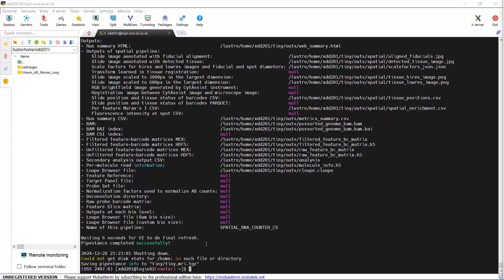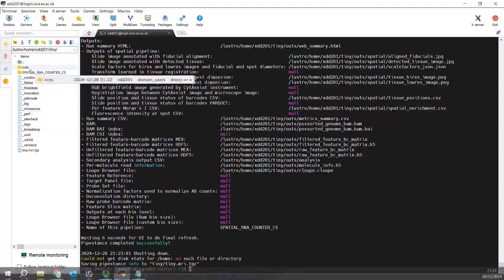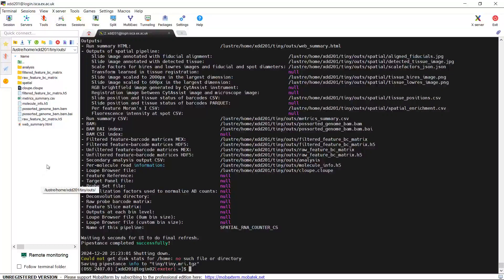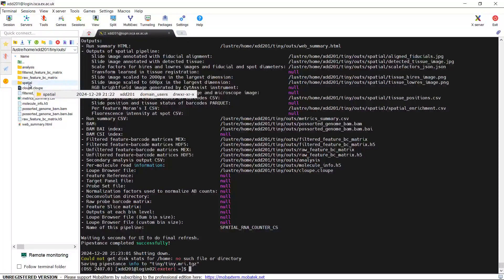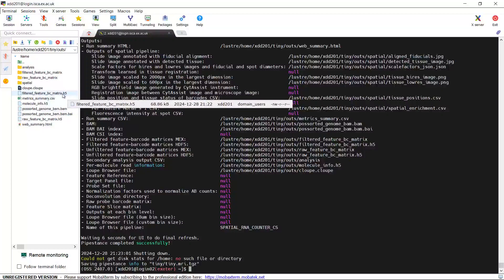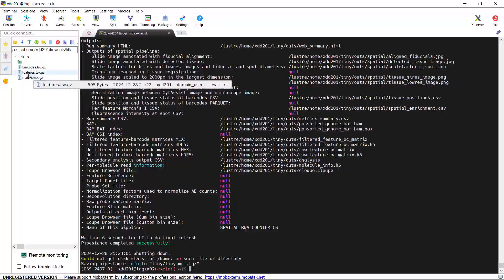We finished the test run. We should have generated an output folder in my account. We can have a look at this folder. In my account, we generated a folder named 'Tiny' for the test run. We can double-click the folder and look at the files inside — here we have the out folder. Inside we have the filtered feature-barcode matrix, raw feature-barcode matrix, and the spatial information. We also have the filtered feature-barcode matrix H5 file. If we click the filtered feature-barcode matrix folder, you can see the barcodes, features, and metrics.